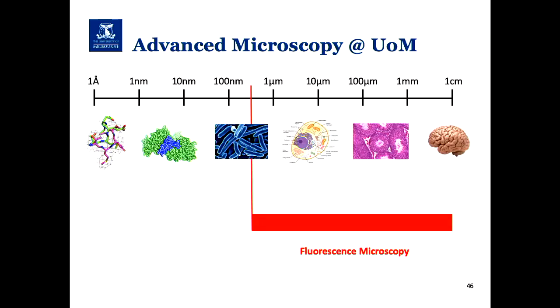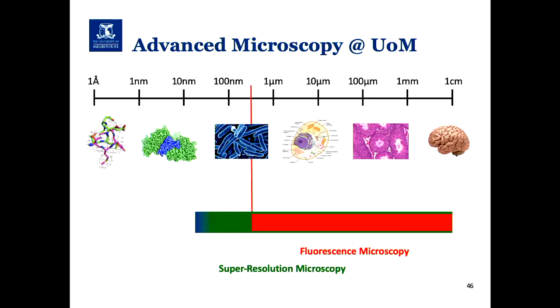If you remember me saying, our lateral resolution limit is about 200 to 250 nanometers. Essentially it's half the wavelength of light that we're using. That's basically one of the laws of physics that's not possible to get past, unless you're very, very clever, in which case you can come up with some techniques that start to bend the rules of physics, and these techniques are called super resolution microscopy.